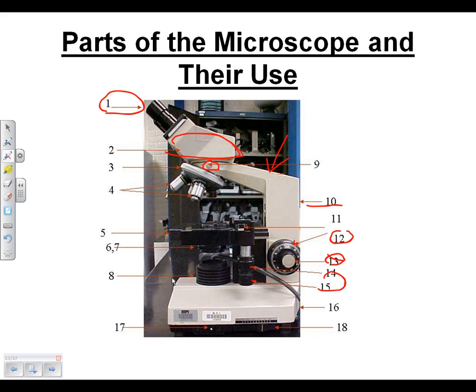Other things you should learn to play with are, and they'll look a little different on the microscopes, a condenser and iris here so that you can play with how much light you actually let through and where it's focused so you can get a better image. And then 8 is the actual light source. So the difference on the microscopes you guys get to use is we have LED light sources in the microscope, so that you have really white light, so it gives you a really good image.